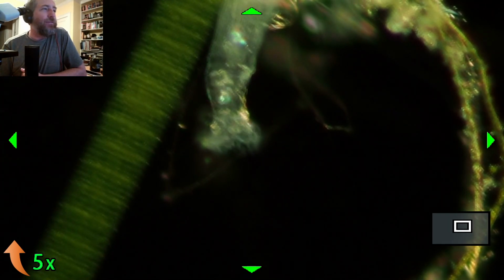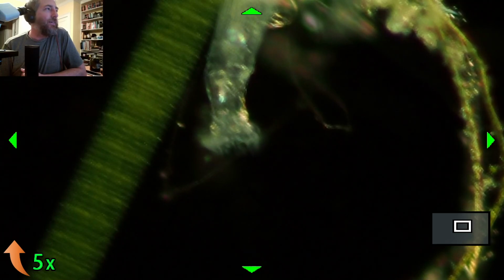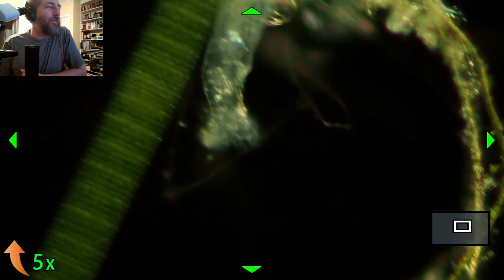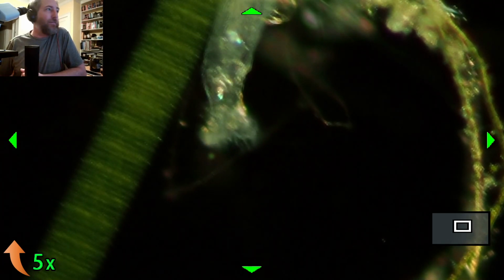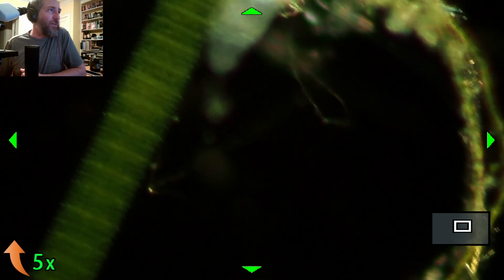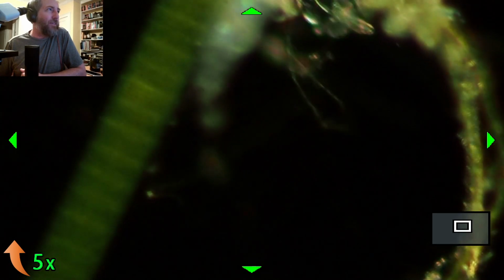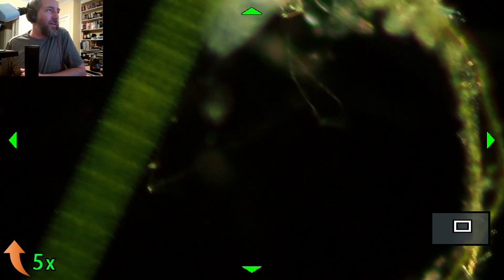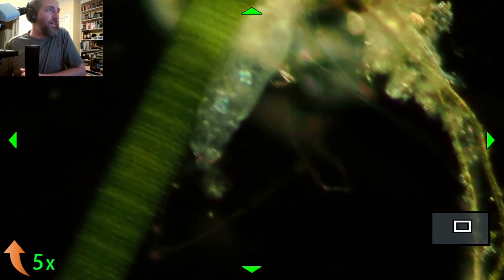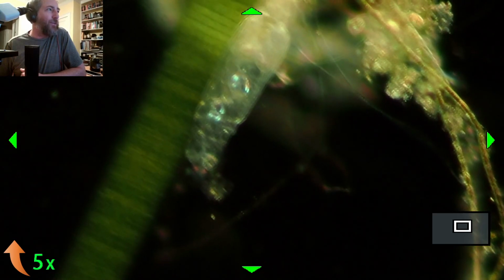The rotifer that they found with the mammoth frozen, then they just brought it back to life, which was fine. Totally normal for them to be able to go for a really long time without having to worry about whatever, and then coming back to life when the conditions are right. That is rotifer behavior 101.